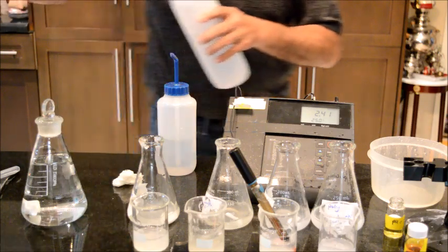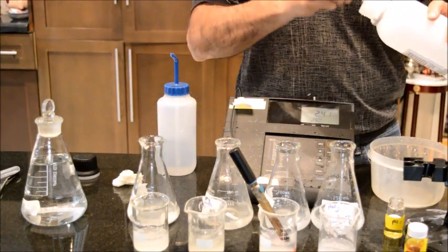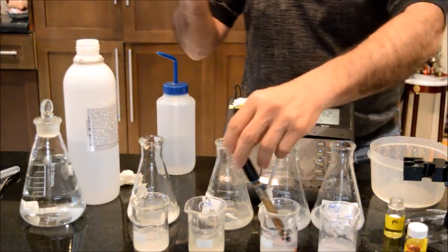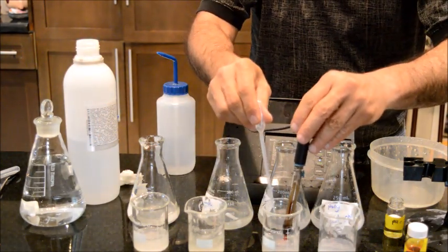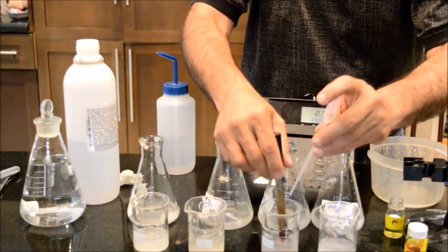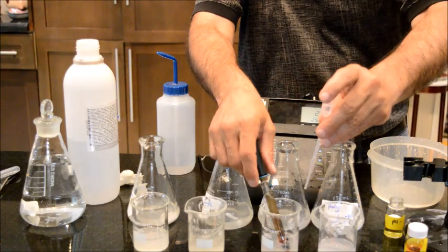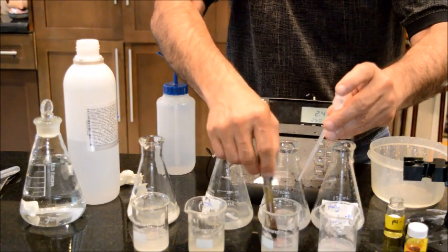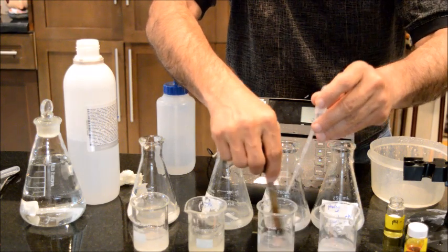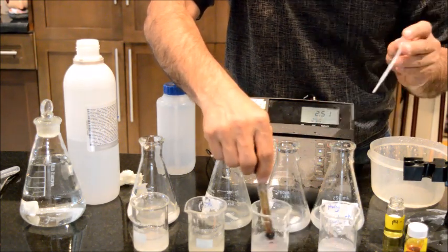The Carbomer, as you have seen in my previous video, as you increase the pH, the viscosity of the Carbomer significantly increases as well. And so it is around 2.5.